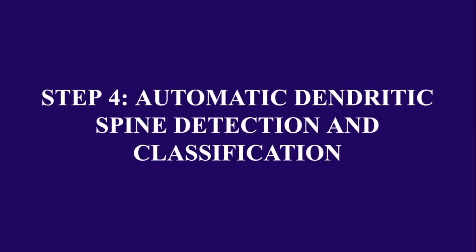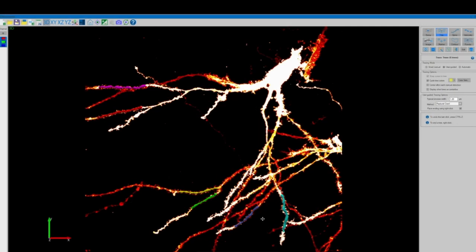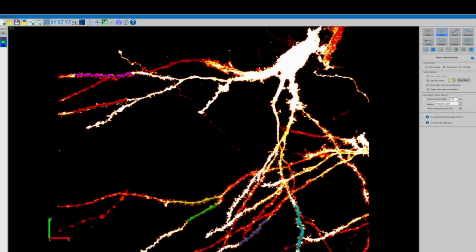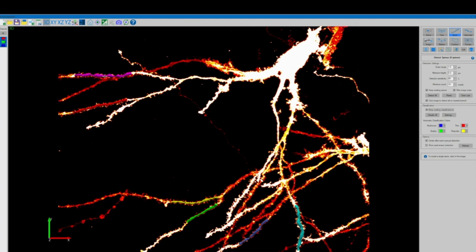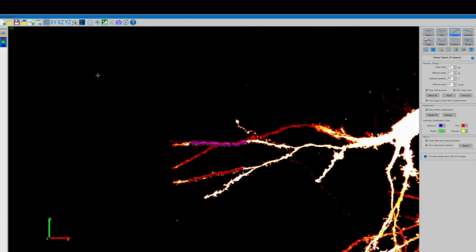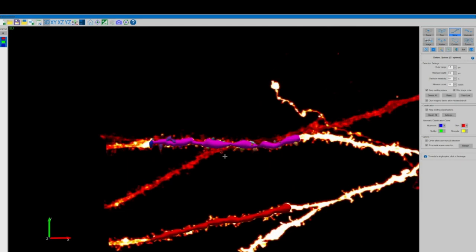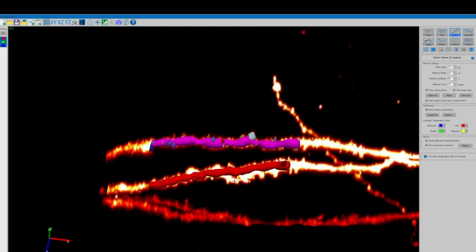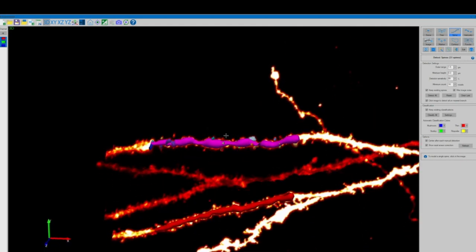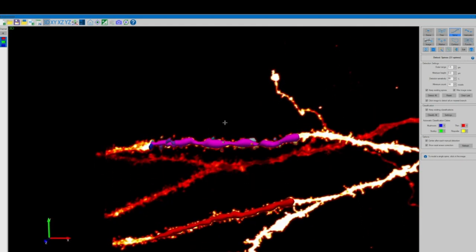Now for the next step we will be using Neurolucida 360's fully automatic dendritic spine detection and classification software. Now heading over to the spine category in the top right corner of our screen we'll adjust all of our detector settings including setting our detector sensitivity at fairly low to begin with and then making sure all of these boxes are checked off. If we go now and click on one of the tree tracing segments from our previous step Neurolucida 360 should automatically detect all of the spines on that segment at the detector sensitivity that we selected.